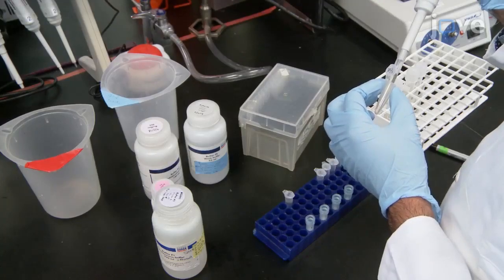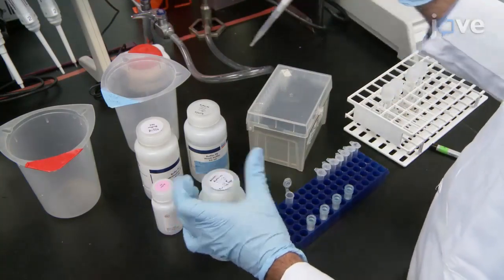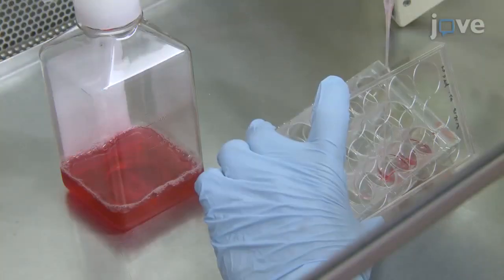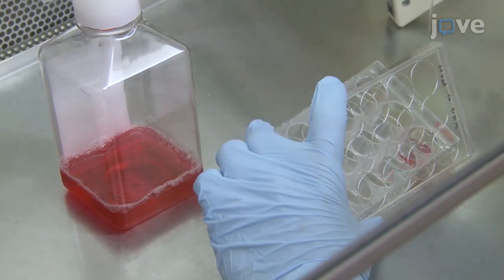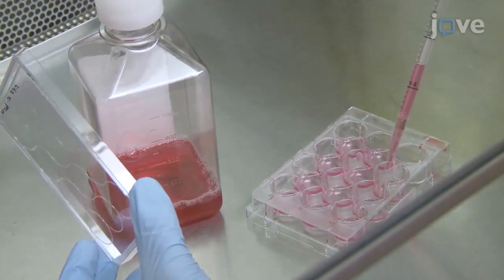To begin, mini-prep LATS-BS plasmids fresh from DH5-alpha bacterial liquid culture. An hour prior to transfection, aspirate the medium from the plate and add 500 microliters of growth medium to each well. One important point is that the LATS biosensor must be prepared fresh in order to get maximum expression and activity.